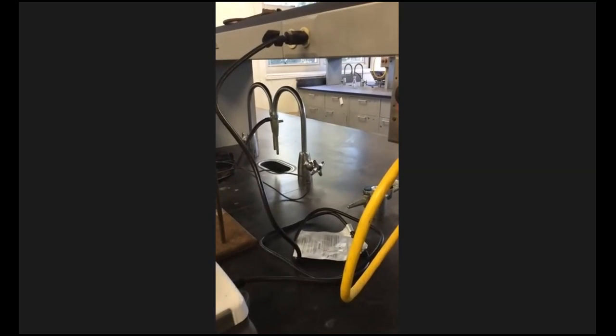So we've heated it for 15 minutes, and you can see this is awesome. That's why I love chemistry. All right. You can see here, how much more is in there now? At first, we started out with just a few little pieces of calcium oxalate, and now look at the bottom. It's almost covered with calcium oxalate.